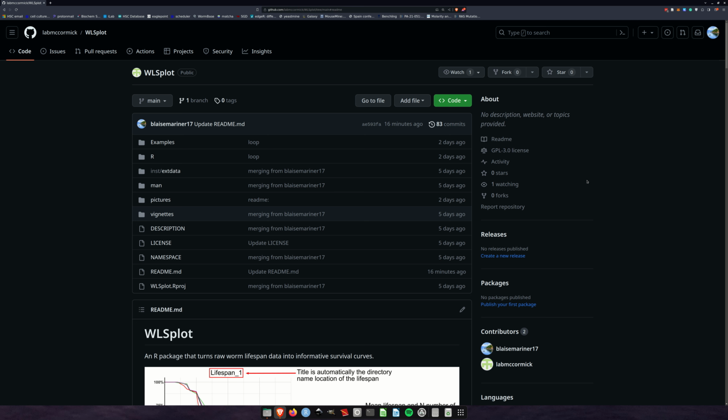Hi everyone, welcome to the video that'll show you how to install and use WLSplot. WLSplot is an R package that turns raw worm lifespan data into informative survival curves.